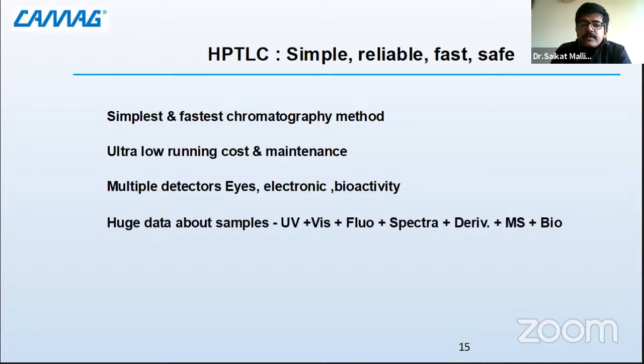And that is why even the ICH guidelines tell you that minimum 5 to 6 levels, you have to give as linearity data points. Linearity is a concept where you have a concentration and the response. They are being correlated and you get a plotting on the graph, which is known as the response factor of the detector towards a known concentration.